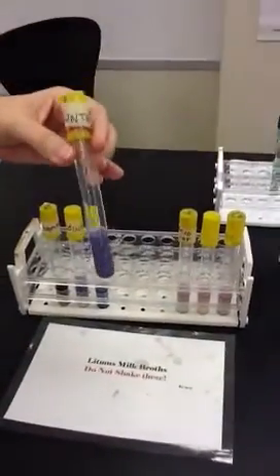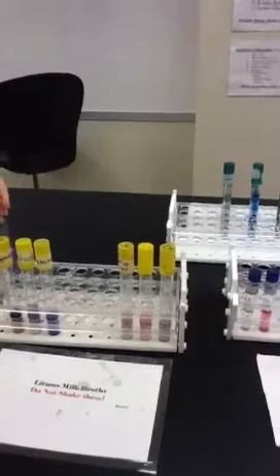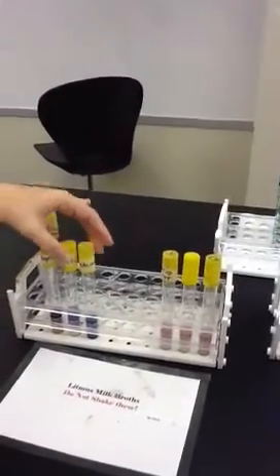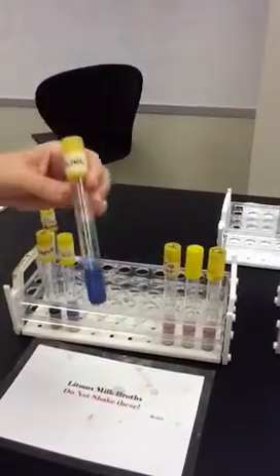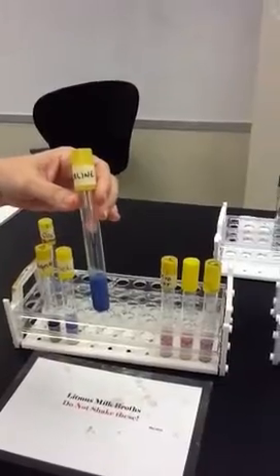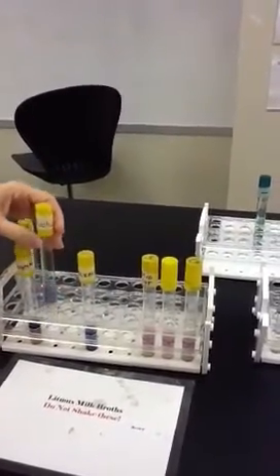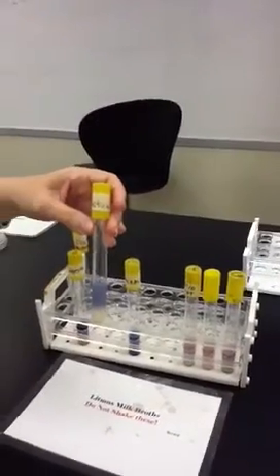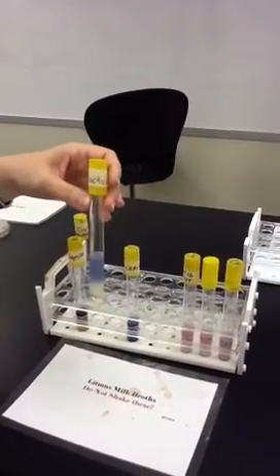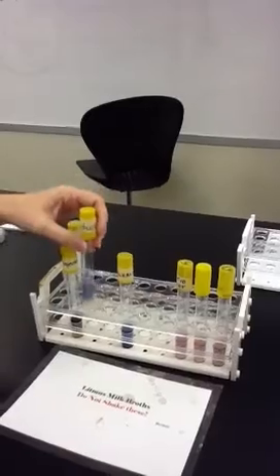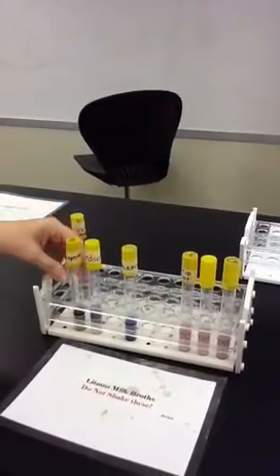Litmus milk. This one's fun. The control. It's blue. Alkaline is truly blue. The other one's a purple blue. That one's more like a... Reduction, which we don't really need to know. Okay. We only have to know alkaline, acid, or complete digestion.